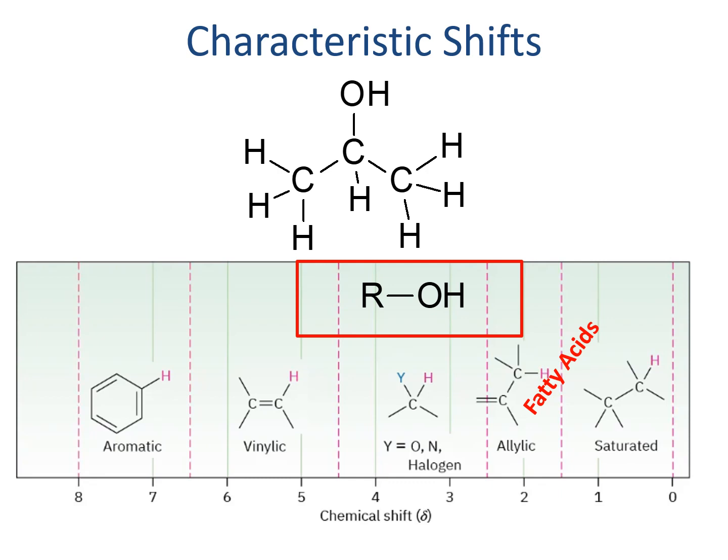So for example, our fatty acids either show up as saturated for most of the carbons or allylic, with protons right next to double bonds. And those two types of peaks tell us about what parts of our body, as we look at an MRI, are made up of fat. Or we might be able to see carbs and proteins show up in a different region. Or we might even see water show up in a different region still.